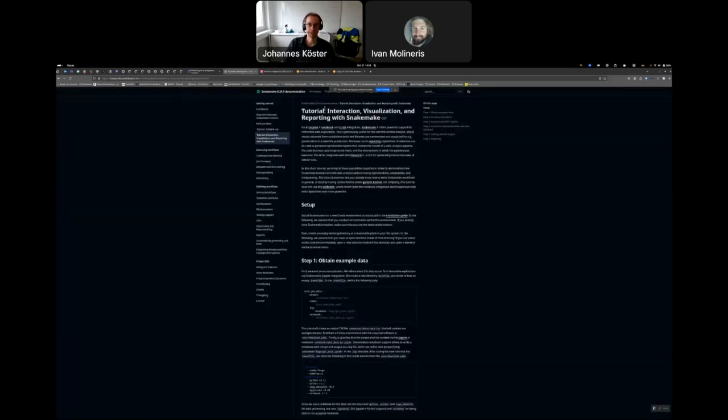What I want to do today is a tutorial, where I basically do this hands-on for you while you are watching me, and you have the possibility to, at the same time, do the same steps that I do at my screen on your own machine. So for that, Ivan has basically sent all of you the instruction to install Snakemake on your machine. There's a couple of things that I didn't think about so far, before crafting this tutorial, and that is the portability of all of this.